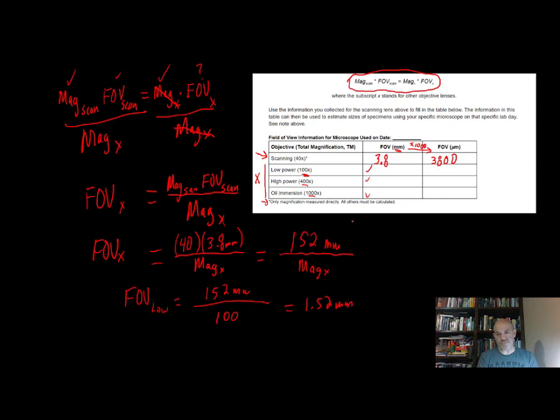Okay. I'm going to go ahead and round to 2 sig figs because there were 2 significant figures to begin with. There's a review of significant figures in your lab manual and lab exercise 2 if you want to go and review that. I'm not going to grade on significant figures, but I'm going to say they are important. So just promote an awareness for that. And if I want to make that into micrometers, just multiply by 1,000.